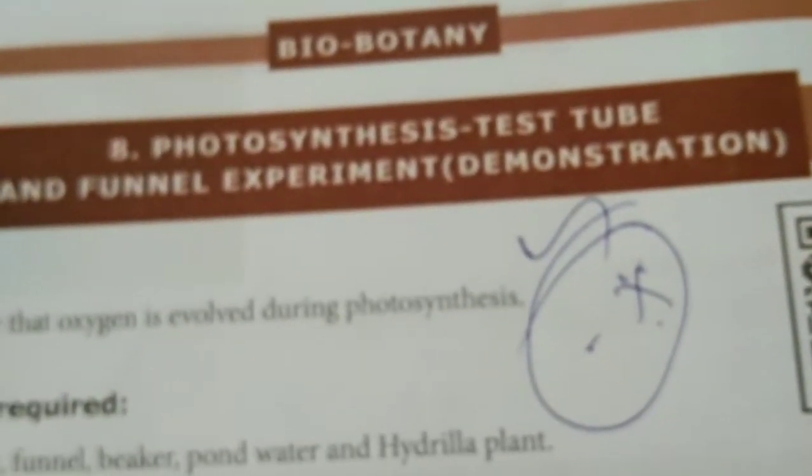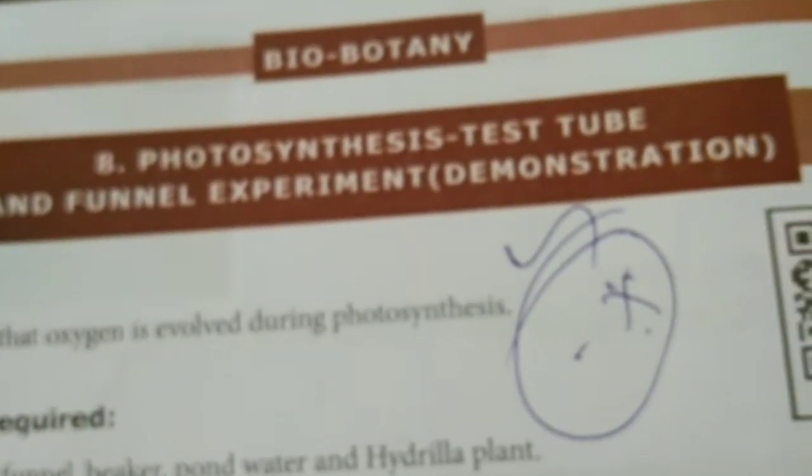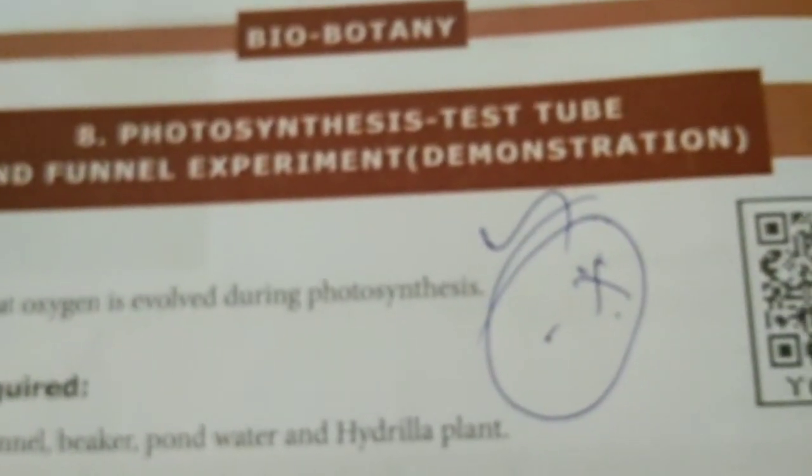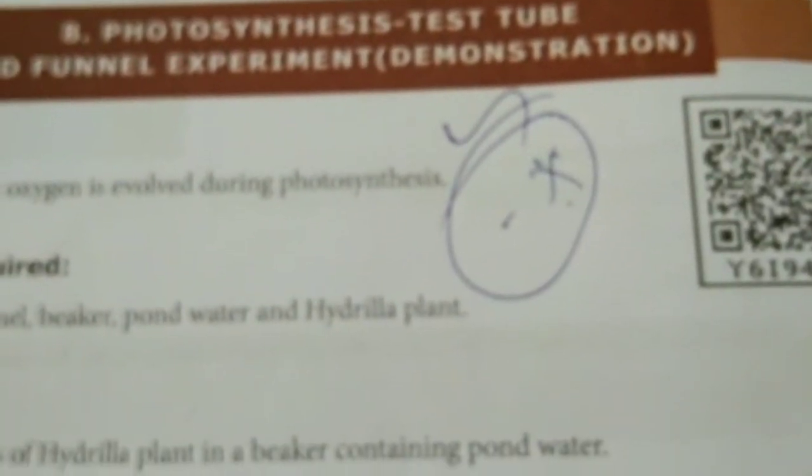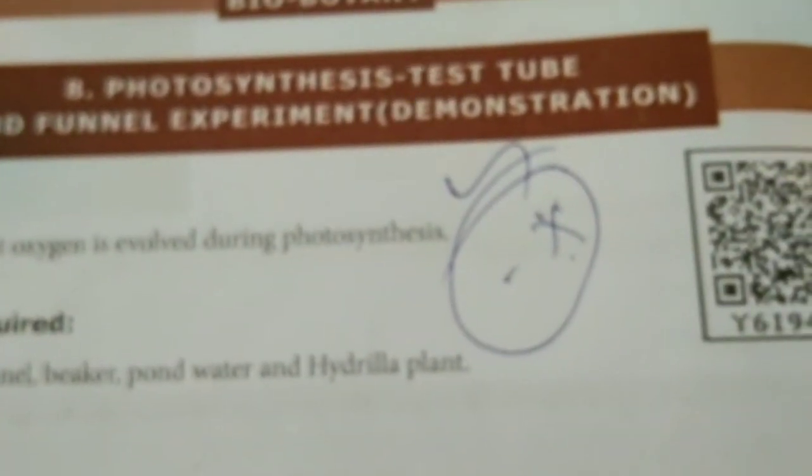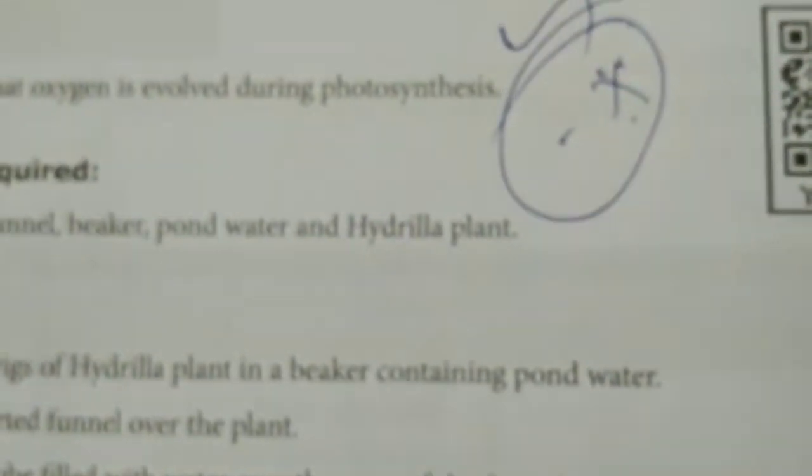Hi dear, now the photosynthesis test tube and funnel experiment. This is a clear picture. What is photosynthesis? Plants prepare their own food with the help of sunlight, water, carbon dioxide, and some other elements. This is going to be photosynthesis.